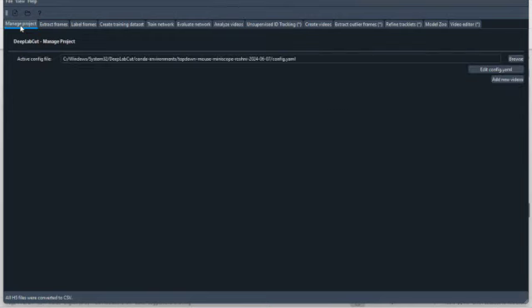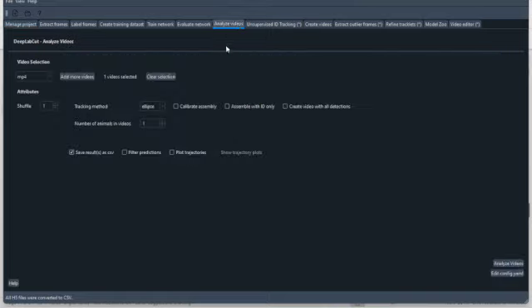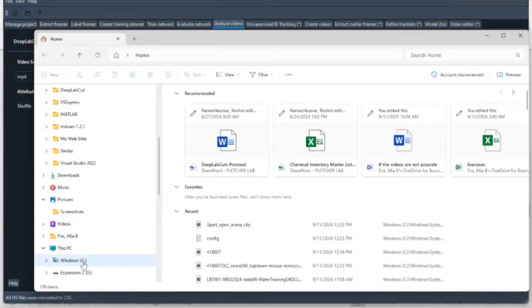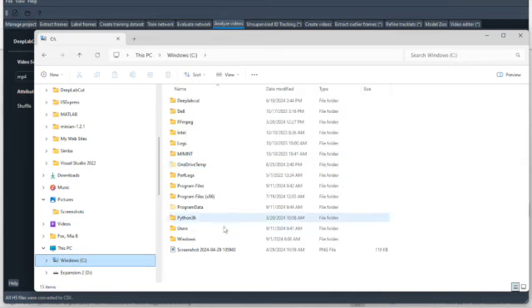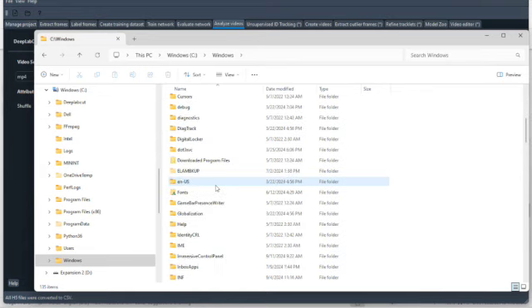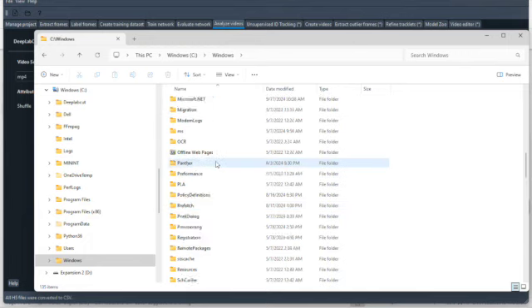So we have already gone through, created a little clip of a video that we wanted to add to label frames of. We added that video to the project, and then we analyzed the video here. So now we have the output of those frames here in our videos folder.